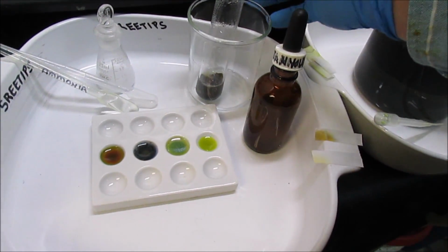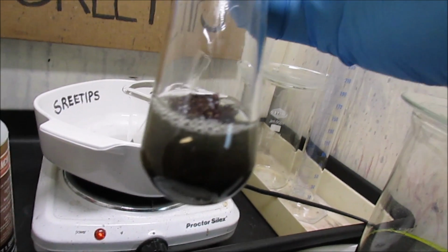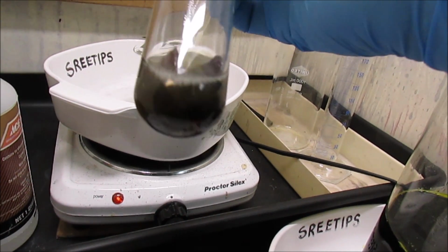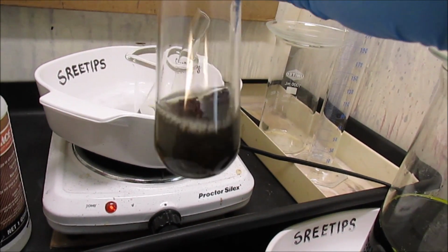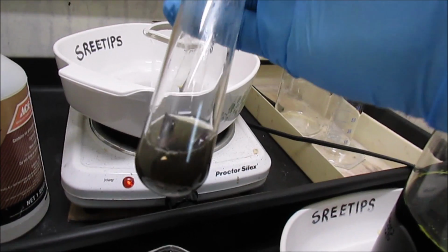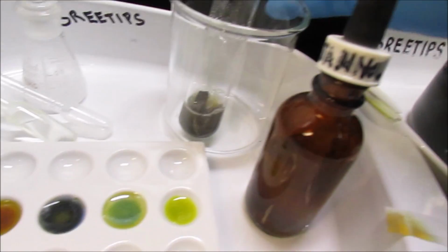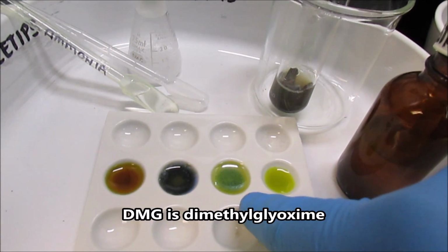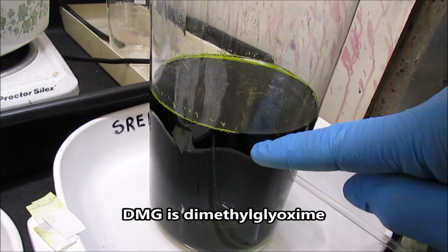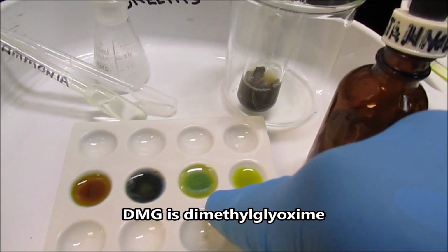All right, based on these tests, I think I got one of 2 ways to go here. See the copper coming out of solution there on the zinc? So this is going to be a black powder, but it'll be heavily contaminated with metallic copper. You can see the copper right in there. But this is possibly a way to go here. The other way to go is maybe use DMG to precipitate the palladium out of here. But I don't know if that'll work either, because it looks like there's going to be some copper in with that precipitate since it's green.